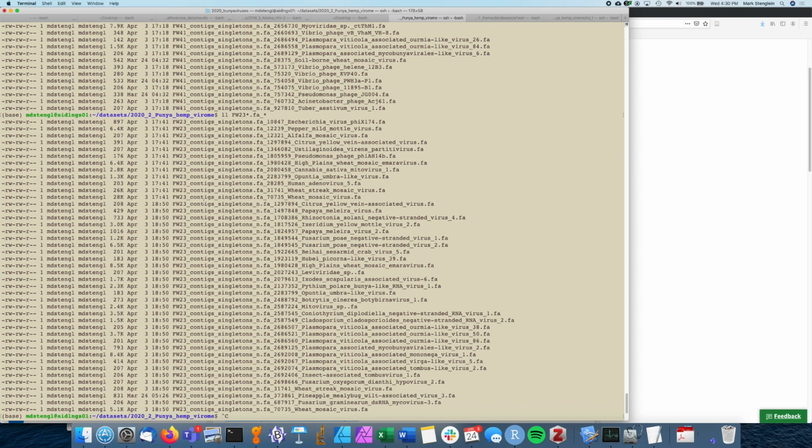These were identified by a BLAST X type search. That's where you take nucleotide sequences, find open reading frames in them, translate those open reading frames, and then use that protein sequence to search a database of protein sequences. From the point of identifying viruses, these are like new or more divergent viruses. So sequences down in here could possibly be more interesting, because these might correspond to previously unsequenced or more divergent viruses.